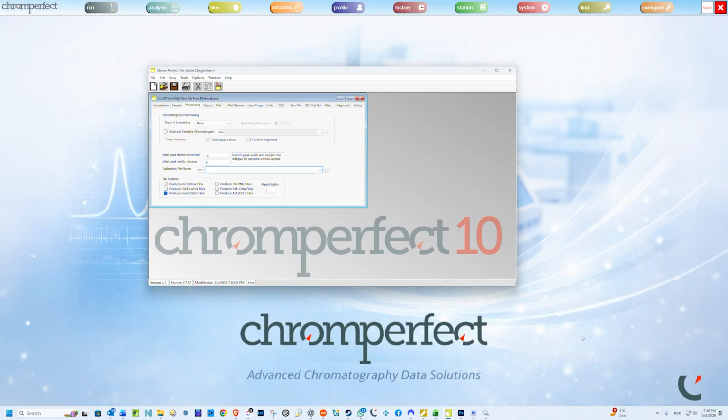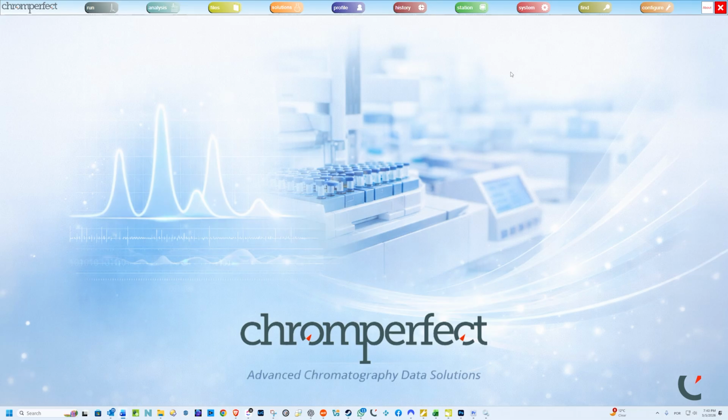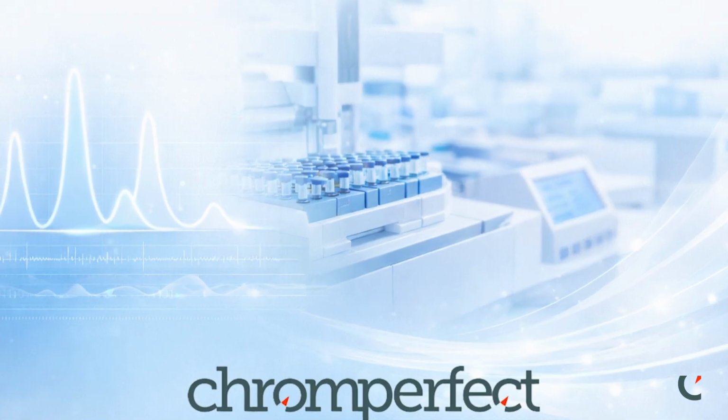Close the method editor. At this point, it is important to clarify a key principle from earlier in Section 2. You may either use a method file with external supporting files, or you may use a solution file that contains those sections internally. You do not use both at the same time. The choice depends on laboratory workflow.